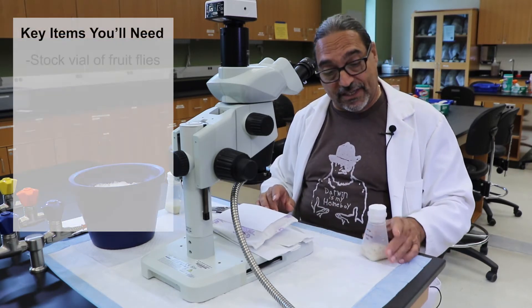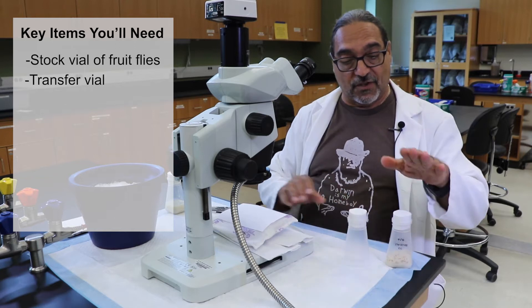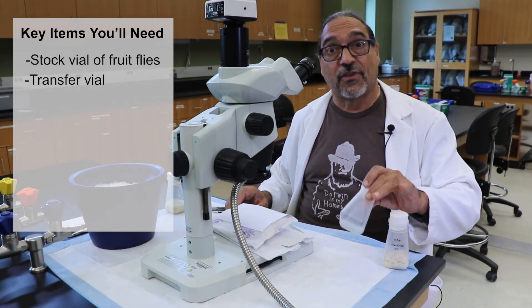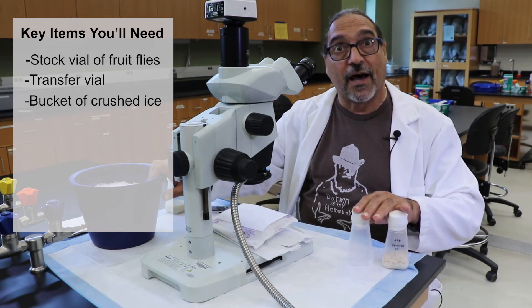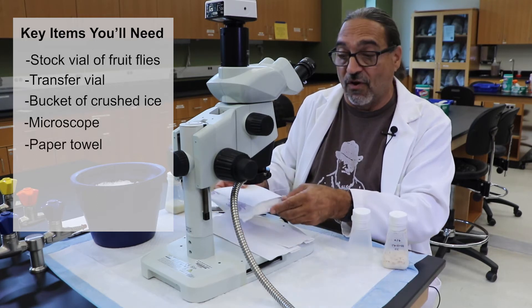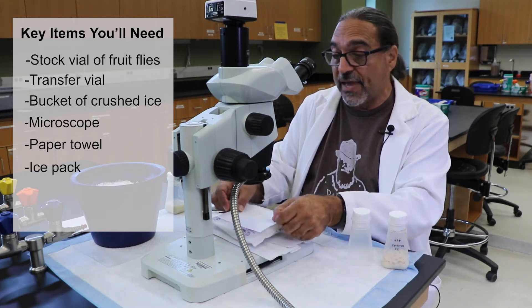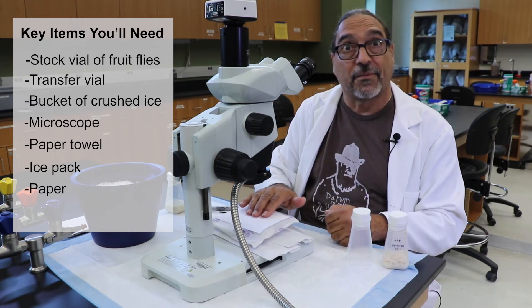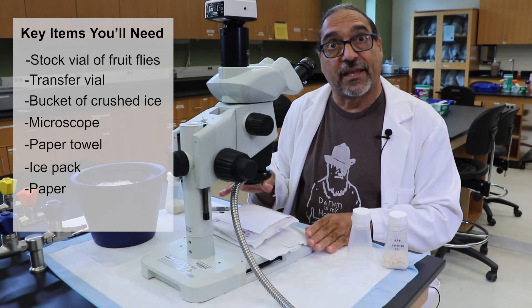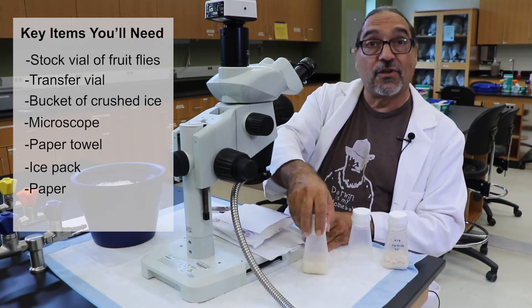Obviously, the first thing you need is a vial, a stock vial of fruit flies. Here we just have our stock vial of wild type fruit flies. And we'll need a transfer vial. We have a bucket filled with ice, just crushed ice. And on the stage of our microscope, we place paper towels because we don't want to get the stage wet. And we use a simple ice pack used in sending cold materials through the mail, covered with just a small sheet of plain typewriter or copier paper. This then will become the stage from which we can view the flies, separate them by whatever phenotype you're interested in discerning, and then be able to put them into the new mating vial.